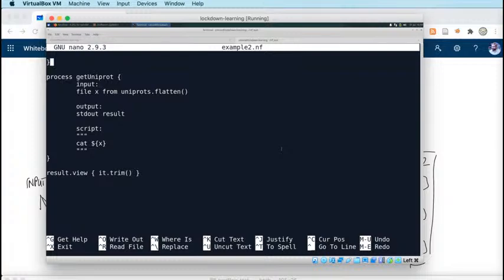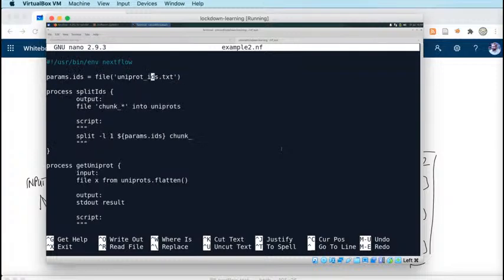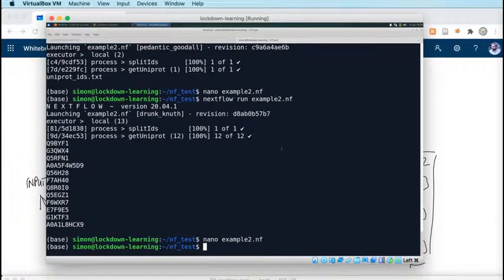Okay. So thank you everybody for your perseverance and patience. Nextflow is the kind of thing which your knowledge and usage of it will improve with use. And I guess what is obvious here is that I haven't necessarily used it a phenomenal amount, but it is an extremely useful piece of software. But there's a lot to get your head around. So maybe we'll learn a bit more together next week.